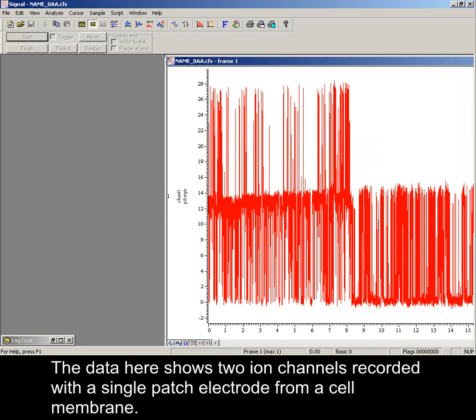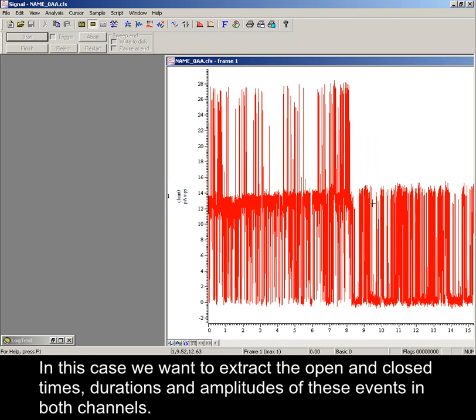The data here shows two ion channels recorded with a single patch electrode from a cell membrane. In this case, we want to extract the open and closed times, durations and amplitudes of these events in both channels.